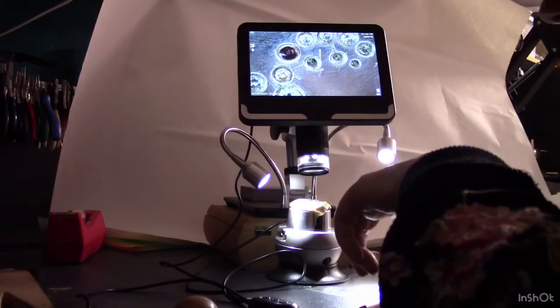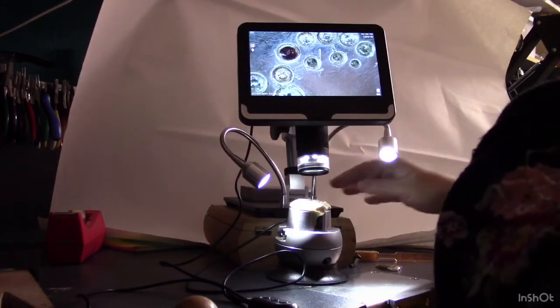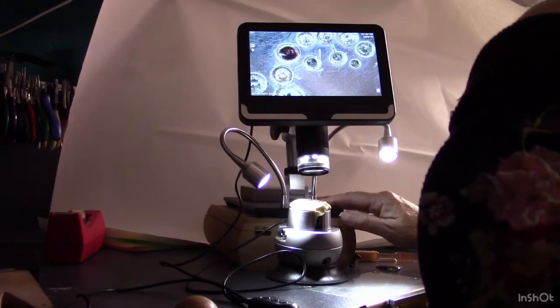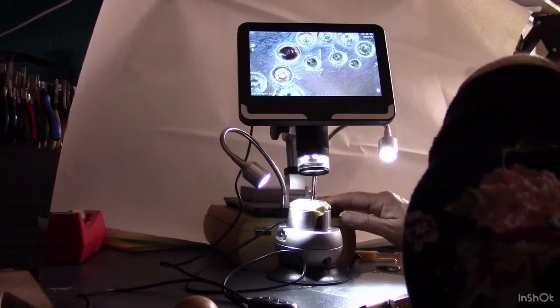This little doodad with the little LED lights and the stand was $138. Yeah, wow, right? And it records.